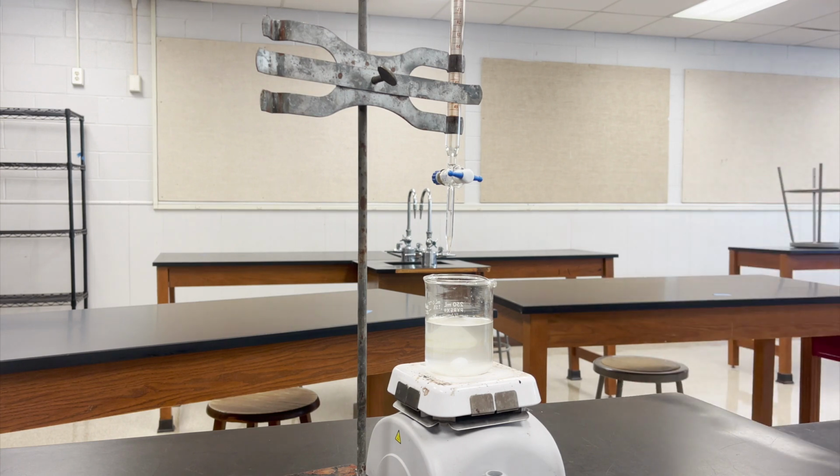and if you remember from your notes, what happens to the equivalence point is the equivalence point gets shifted upwards, and so this is going to make it to where the end point, which is where it turns pink and stays pink, is close to the equivalence point. So what we're going to do now is turn on our stirrer.